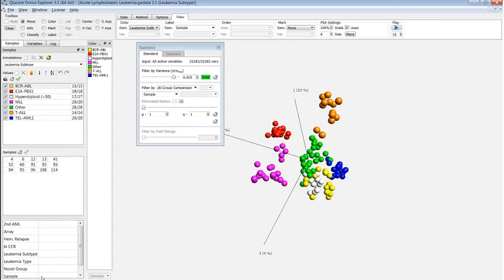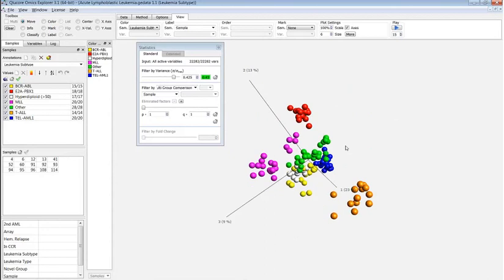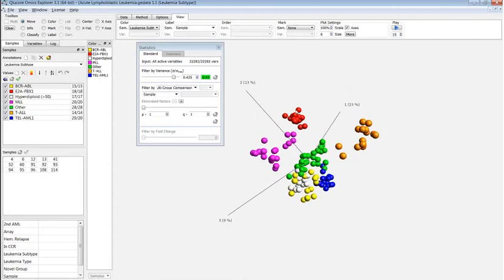We also see that the magnitude of the number of variables left corresponds very well to the number of variables contributing to the leukemia. That should be around 100 or so.